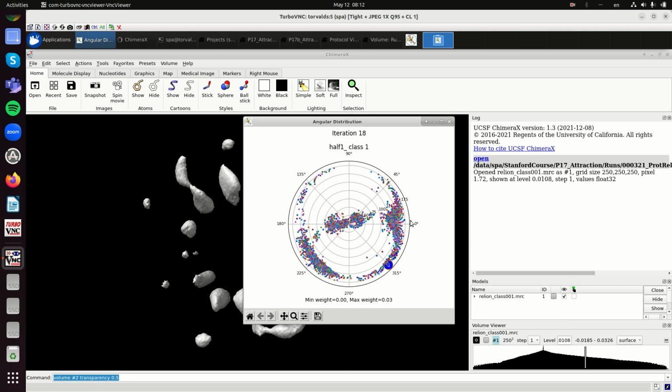In one of my papers, the one describing CL2D, we describe that when you assign a particle to a class, you have to compare that particle to that class, and for that you will use a correlation or Euclidean distance or anything of the sort. And anything that is somehow related to Euclidean distance, you will have two comparisons. One is the signal itself, but also the background.